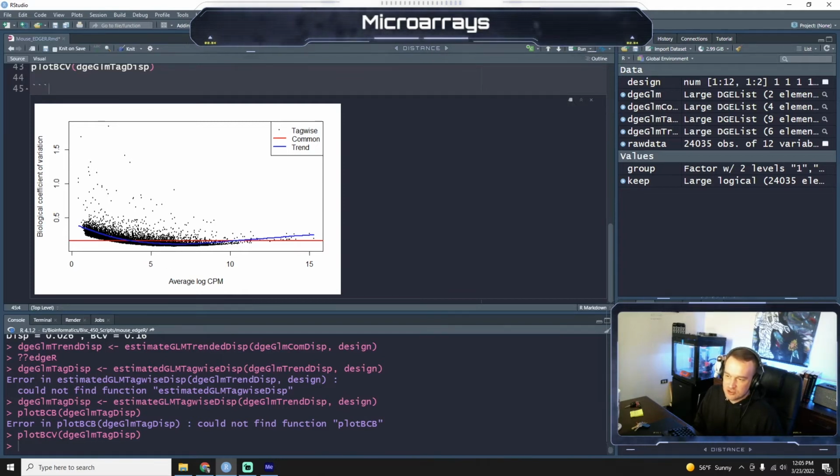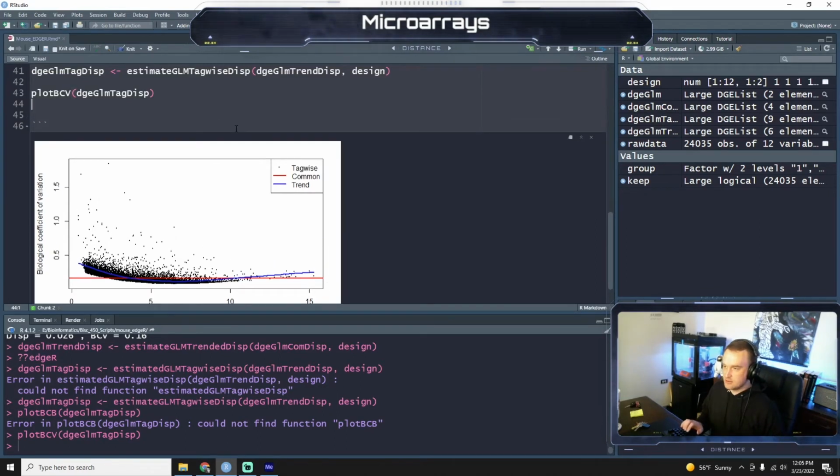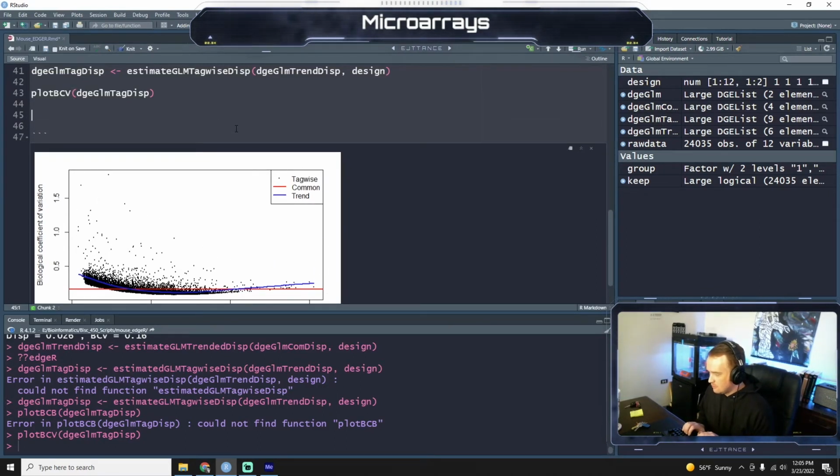This gives you a distribution of the variation between samples, and so you want to see something uniform here, which this is pretty decent. So that shows that between our biological replicates, we don't have a ton of mess, and that they're somewhat uniform.